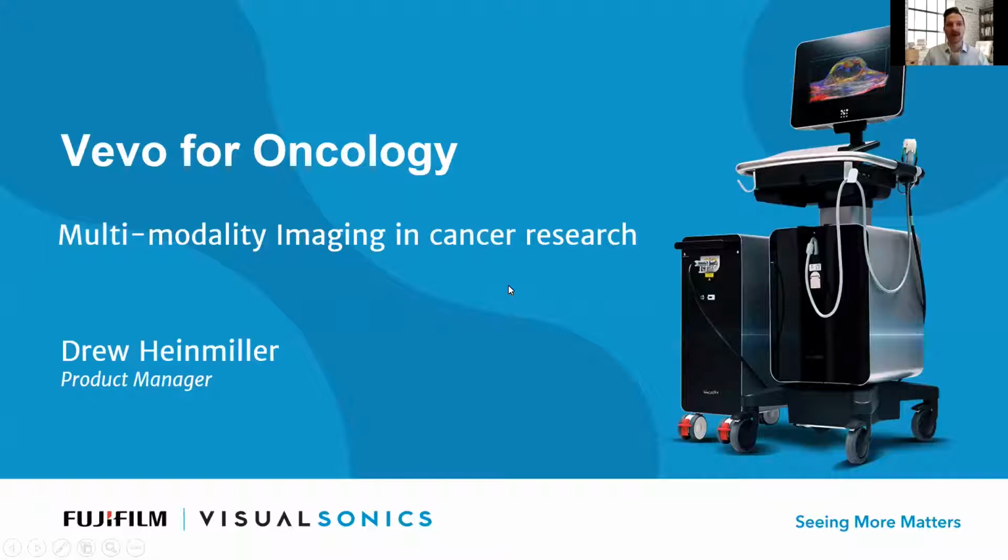I want to start off though with a poll. So Mandy, if you can bring up that first poll question, and this relates to whole body optical imaging versus photoacoustic imaging for oncology research. So the question here is, which is better for whole body imaging in oncology, optical imaging, that's bioluminescence and fluorescence imaging, or photoacoustic imaging?